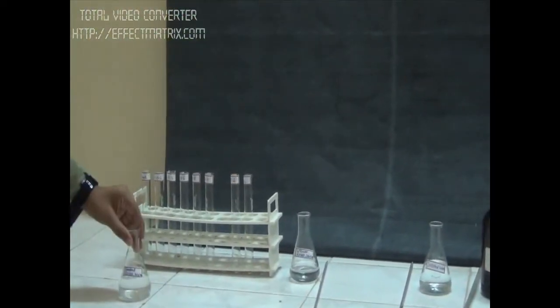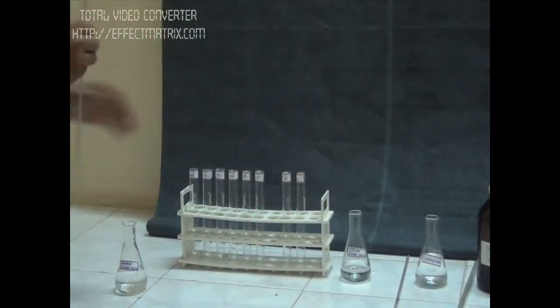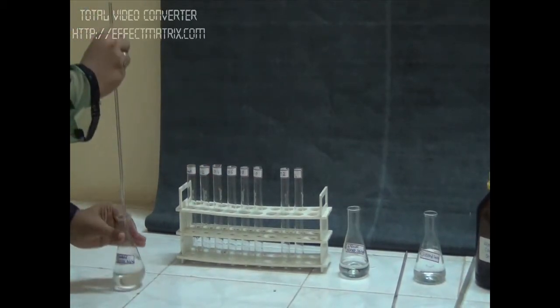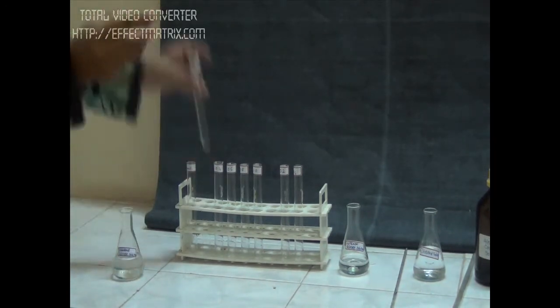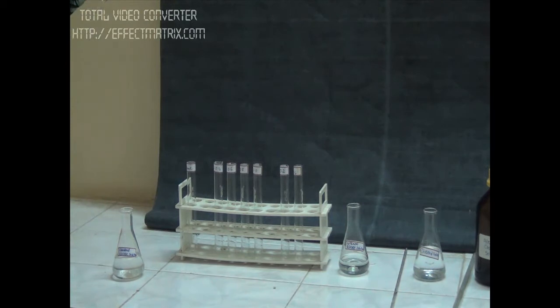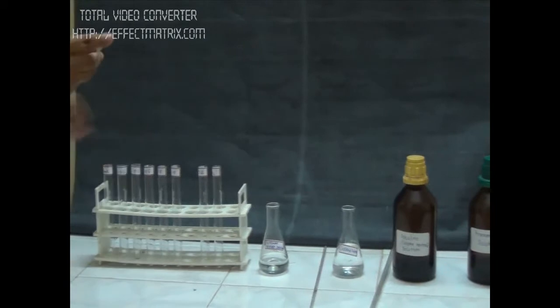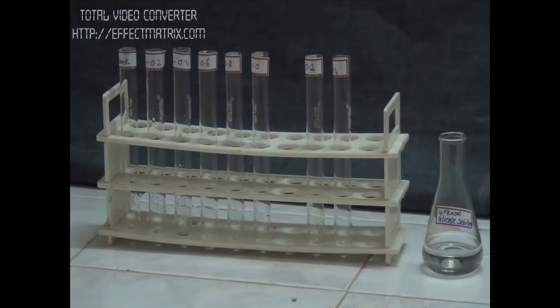First of all, we are going to take our standards. We have taken aliquots as 0.2, 0.4, 0.6. So I take my first aliquot of 0.2. I will use standard reducing sugar. Next is 0.4. Then we have to add 0.6 and 0.8.